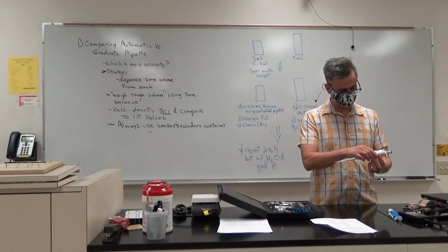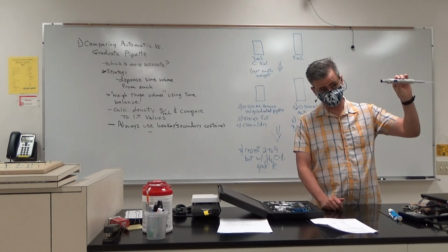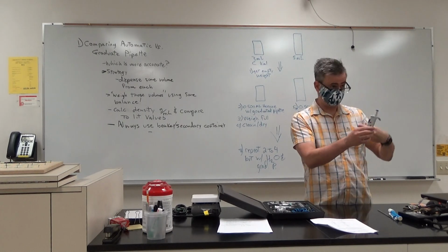All right. And so this one right now is listed as 1,000, so that would be 1 milliliter. Nope, we don't want that much. So we'll turn this down, and we'll go down to 500.